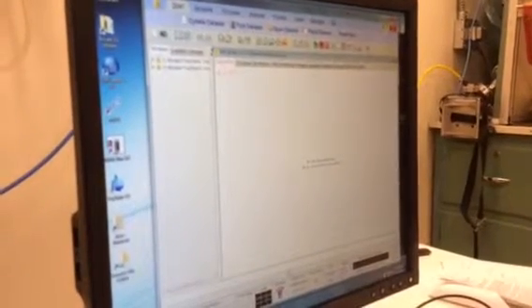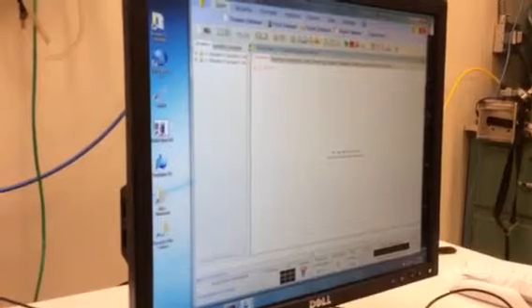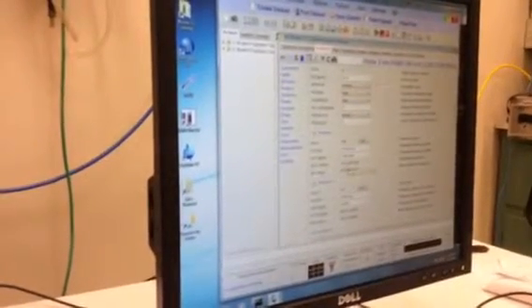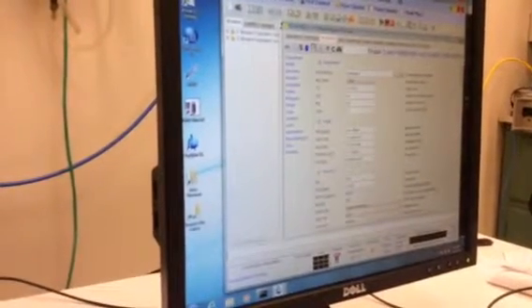Okay. What we're gonna do now, Olga, is we're actually gonna type get prosol just to dump in those default F19 parameters. Okay, which should show up in here. So we're just gonna go down and check on a few things. So there's F19. That's actually the frequency, 470, very close to 500 megahertz. And then we're doing proton decoupling also. So one thing I would like to see just before we move on is how everything's routed, so to speak.